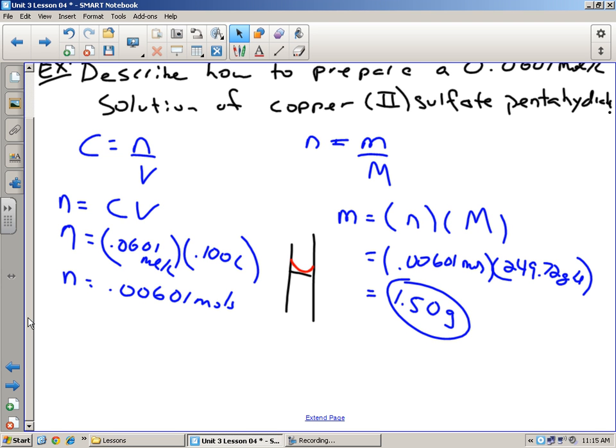You're going to have it in here. You're going to pour it into here, into your volumetric flask. So you're pouring it in. That's fine. Do you think all the solid got off of here into here? Probably not. You're going to have to get someone with a distilled water bottle to spray some water carefully to make sure all the solid gets rinsed into here. That solid has to all make itself into the volumetric flask.